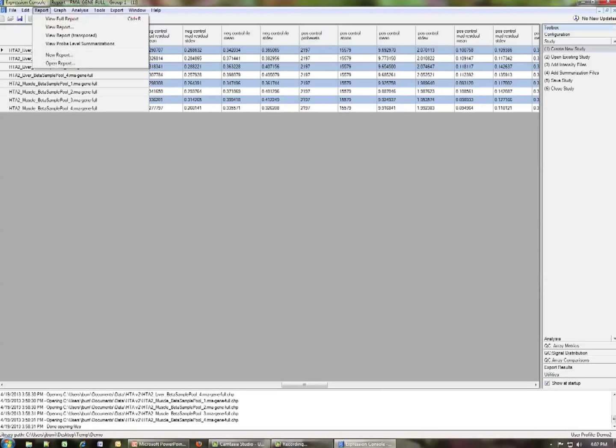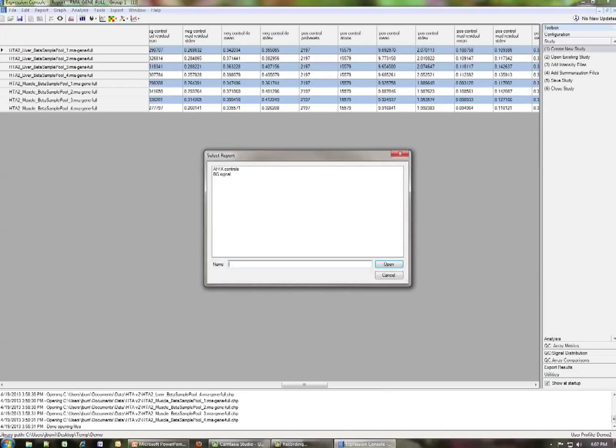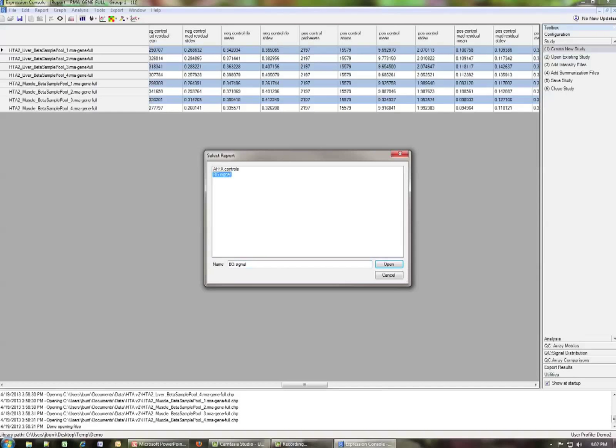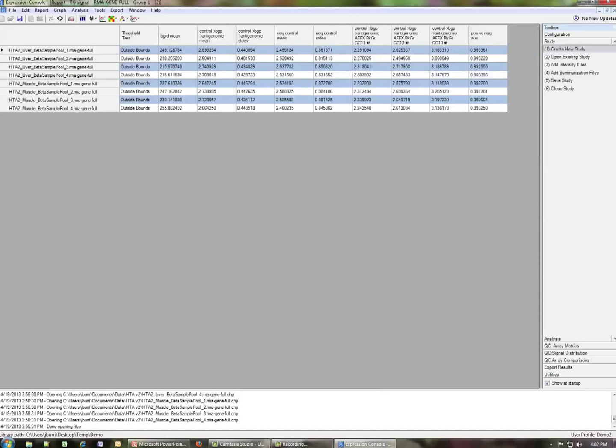So now if we go up to report and we click instead of full report, we do view report. We have two options. We have the BG signal and the AFFX controls. Let's first by opening the BG signal.